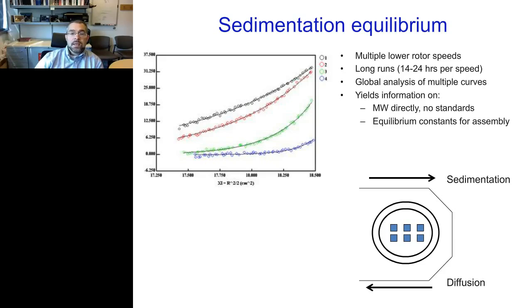But what happens is we have obviously centrifugal force acting on our protein, and so sedimentation is throwing our protein outward toward the outside of the cell. And any time in chemistry that you build up a concentration gradient, and we're throwing protein to the outside of the cell, that's building up protein in the back here, we have a concentration gradient. So then you have diffusion against that gradient, okay?